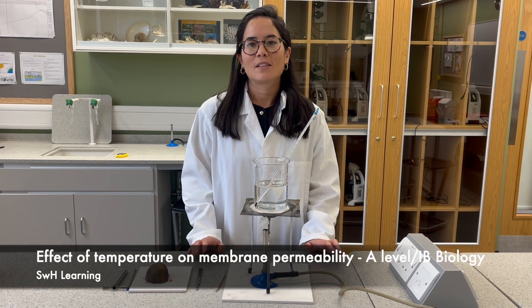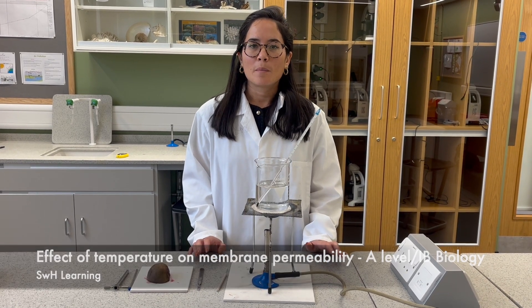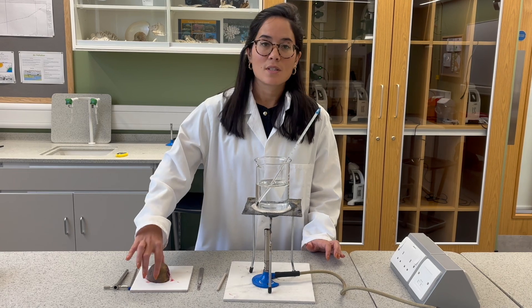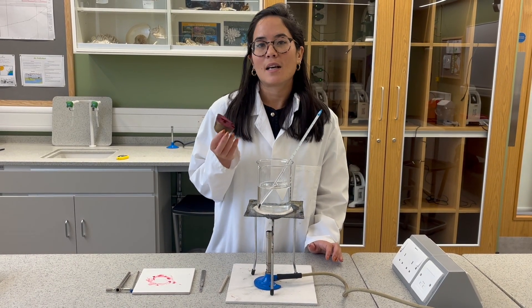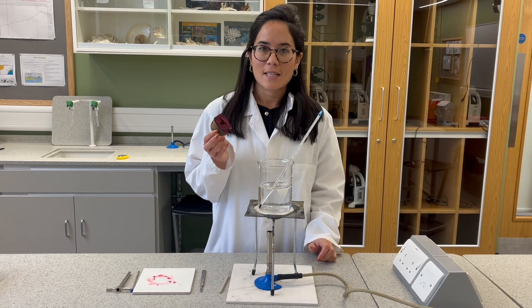Hi everyone, today we're looking at the effect of temperature on membrane permeability. We're using a beetroot to demonstrate this. Why beetroot? Because it's highly coloured and has a very distinctive red stain.